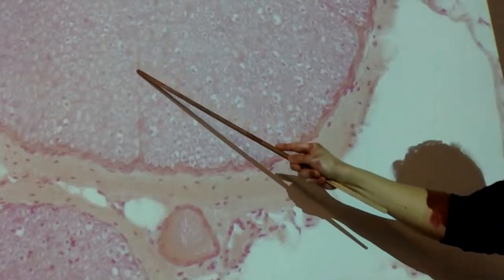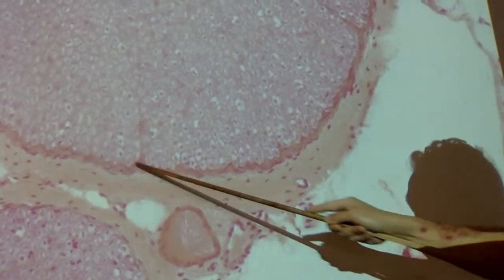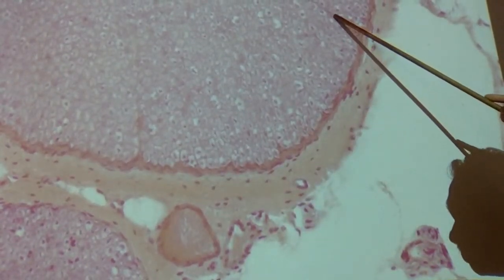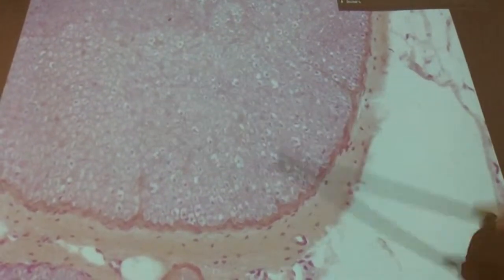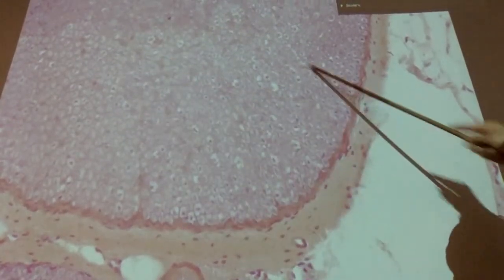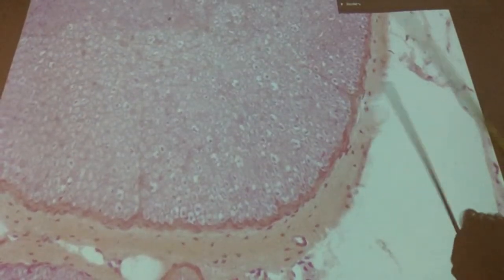This line here, it's a bit darker, extending from this darker red part, goes around, and then it continues up this way. This is a fascicle. I know I can't see the whole border like over here, but this is a fascicle. So this darker red, that's perineurium.